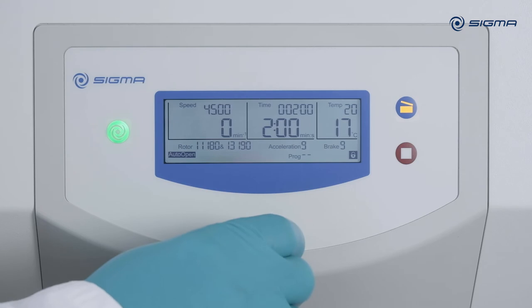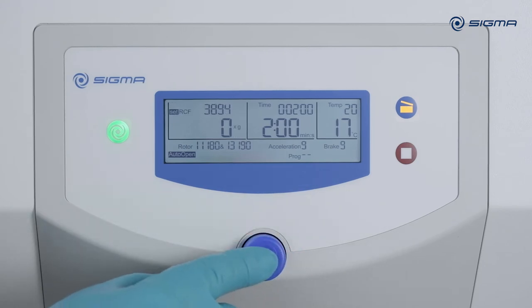To set the RCF, turn the knob two clicks to the right. Press the knob and select a value, then press the knob again to accept the new value.